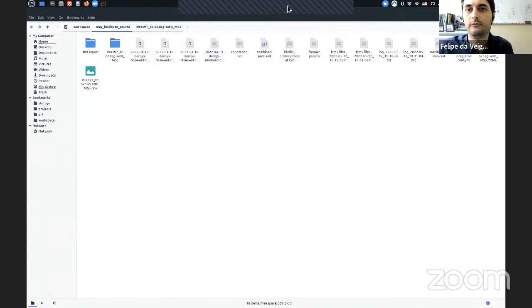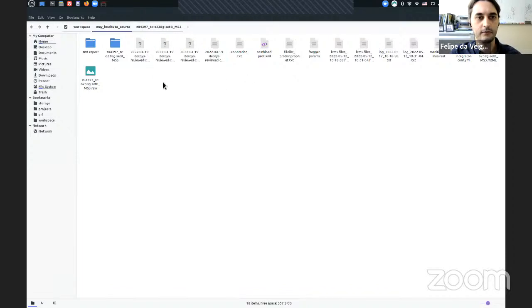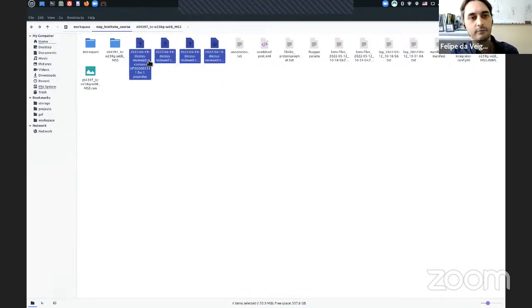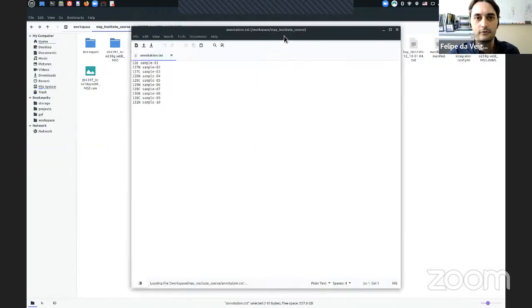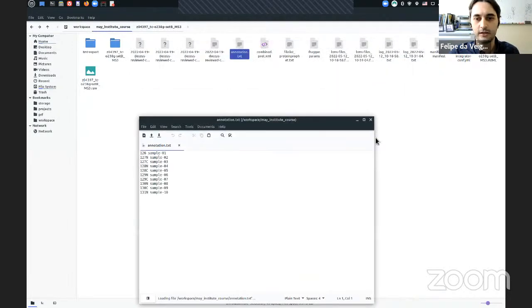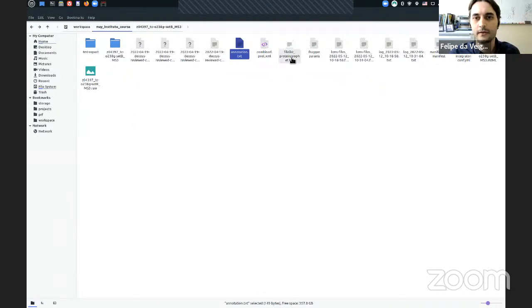Okay, so I believe you can see my folder here right now. There will be a lot of files generated in your folder when the analysis is done. I'm just showing here the root folder of the project that Fengchao just executed. We're going to see the database file and the binary representation of the database file. We don't need to work with that. Here is the annotation file that we use, just in case you want to look again and see how the samples were annotated.